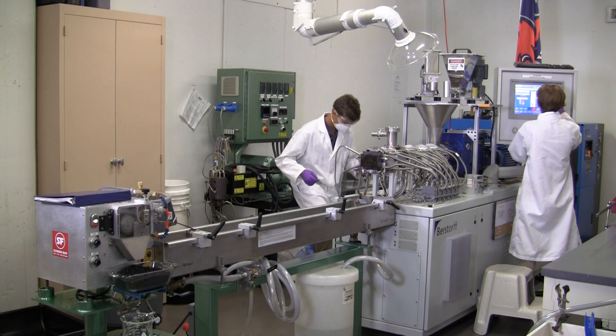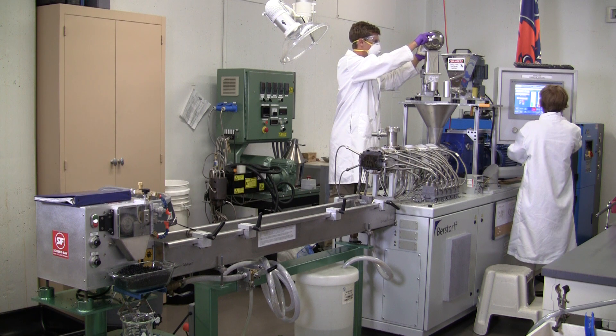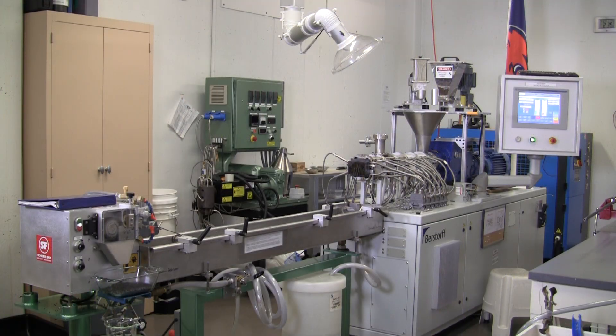Working with me on this video tour are two research assistants from Lewisburg High School. I'm Bromson Furster, and I'm Tim Seringa. Here we are in the polymer processing laboratory, located in the basement of Break Iron Engineering Building, where the SSME system is housed, among other advanced polymer processing equipment. The SSME instrument is a custom-modified 25-horsepower twin-screw extruder, manufactured by Krauss Maffei Burstorff Corporation. It employs 25-millimeter diameter co-rotating intermeshing screws, with an L over D ratio of 35.